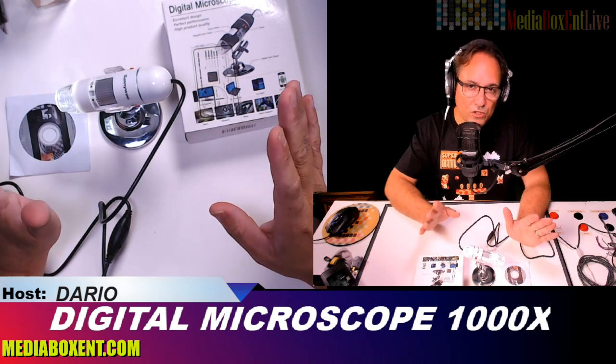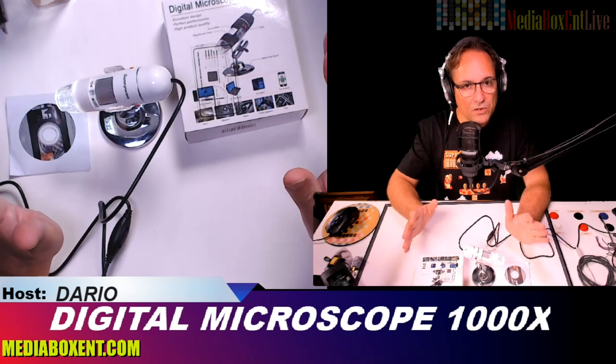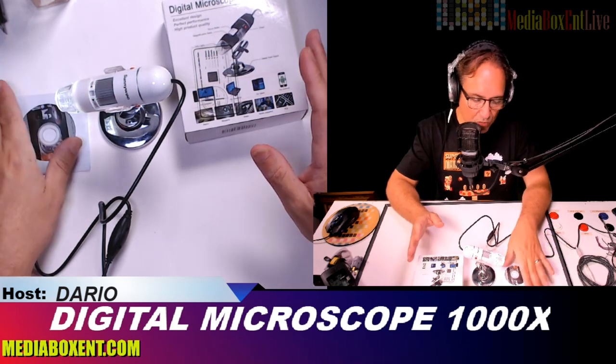This can be installed on Windows 10, Linux, Mac, and even on an Android phone. For the purpose of this video, we're going to be testing this on Windows 10 — we've already got it installed.